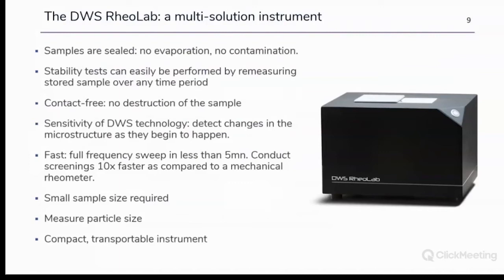Something I also mentioned earlier is that you can load the cells with as low as 150 microliters. So if your sample is precious, this can come very handy. So you don't need to load 1 or 2 milliliters of the sample at once. You can use very, very few amounts. And you can also recover it after the measurements. You've seen that we use glass cuvettes, of course, provided that they are very clean, that you maintain them well. Nothing prevents you from recovering the sample and using it for another characterization method.